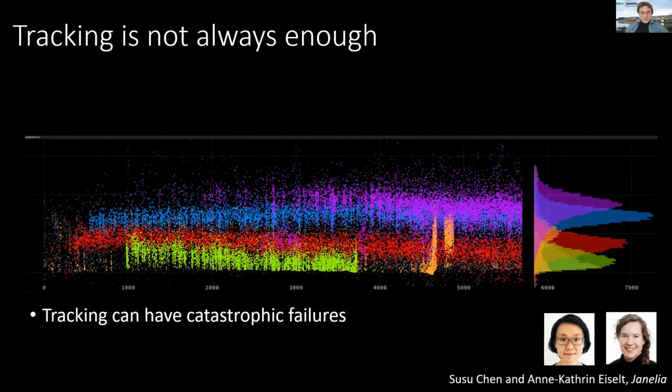And this is something that's been motivated just by seeing enough recordings, particularly ones that were a little longer, like this one. It's about 2 hours. You can see there are neurons that are dropping in and out in different places, right? Every color is a neuron. Some of them are tracked for most of the recording, but then they drop out either here at the beginning, like the blue one, or the yellow one drops out for half of the session and so on.